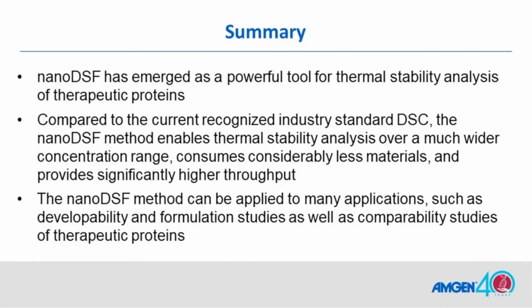Here is the summary. I have shown you the nanoDSF and its applications. NanoDSF has emerged as a powerful tool for thermostability analysis of therapeutic proteins. The nanoDSF method enables thermostability analysis over a much wider concentration range, consumes considerably less material, and provides significantly higher throughput.